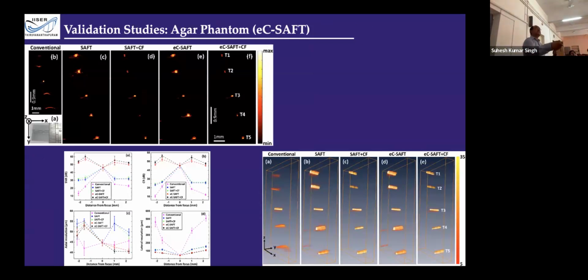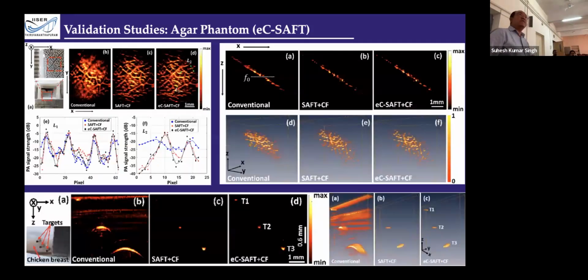If it is not satisfactory, then we do it. See, these are our results. Okay, so the microscopy resolution goes from here to here, from the micrometer regions to the centimeters. This is our contribution that I would like to say. These are the images of human hair embedded in the agar samples. Okay, this is the control sample, I would like to say.